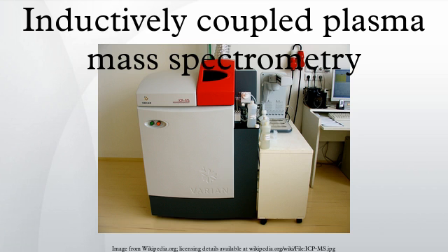and precise interpretation. Maintaining the plasma requires a constant supply of carrier gas and increased power consumption of the instrument. When these additional running costs are not considered justified, plasma and most of the auxiliary systems can be turned off. In such standby mode, only pumps are working to keep proper vacuum in the mass spectrometer. The constituents of an ICP-MS instrument are designed to allow for reproducible and stable operation.